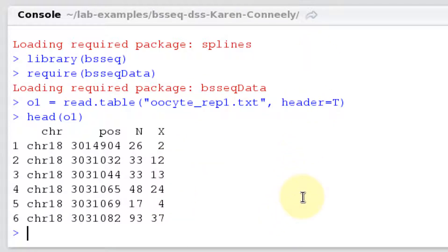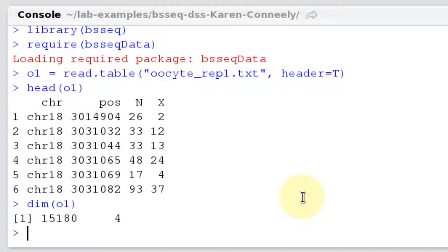We might want to know more about the data — how big it is, how many rows there are, since each row corresponds to one position along the chromosome, and each position is a CpG site. We can use the dim function, since this is basically a matrix, to ask its dimensions. We've got 15,180 rows and four columns, suggesting 15,180 CpG positions. Even though this is RRBS data and we're certainly not getting all the CpGs in the genome, this still seems a little bit small — it's probably not the entire genome.